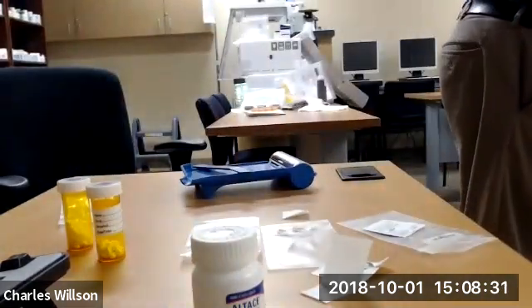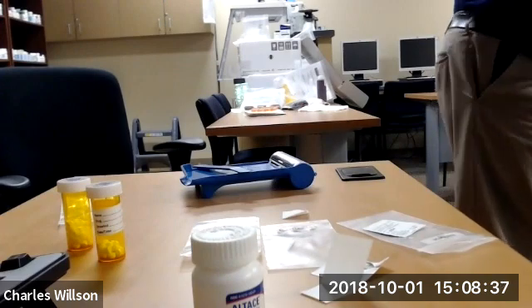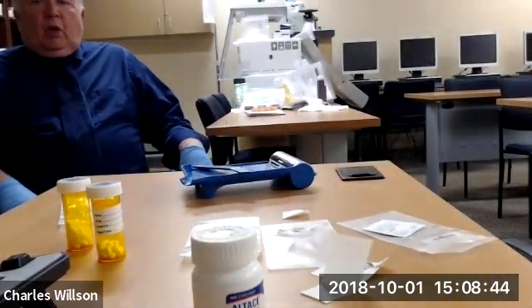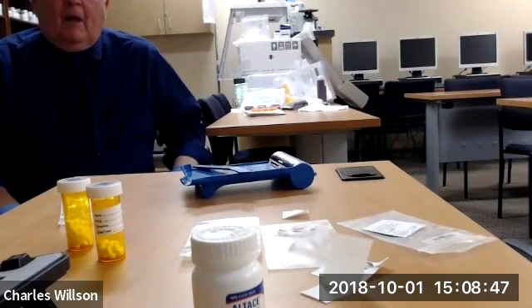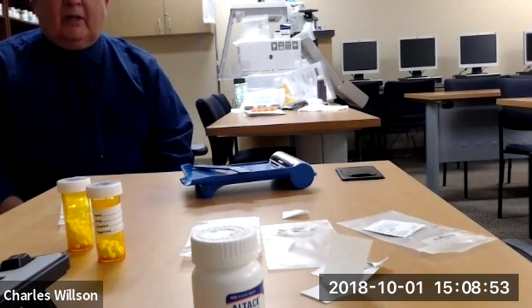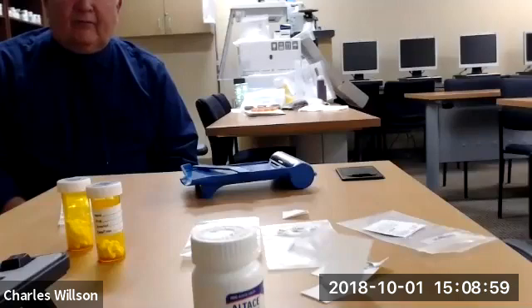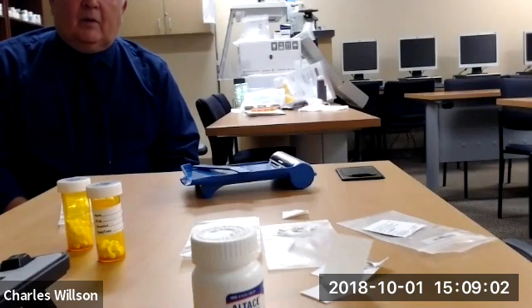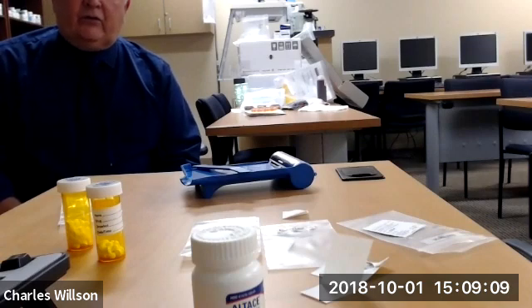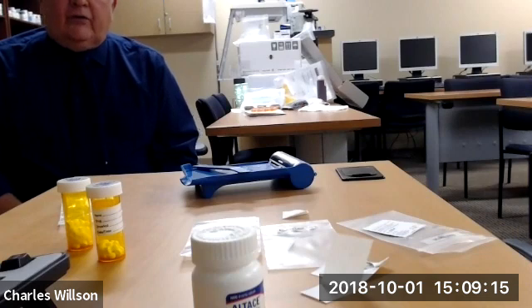Okay. So we did that, and screw the lid and label it. Okay, so that's the lab. Okay, so we've done lab 2, experiment 1. We counted tablets using a counting tray and spatula, and we were very clean about it. We wore gloves and we used our alcohol swabs, you know. And again, that's a little exaggerated for purposes of this lab, but the idea of this lab is not to show you how to fill prescriptions today. The idea is to get you accustomed to using the things that you have to use in order to work. Okay, so I think we've done that.